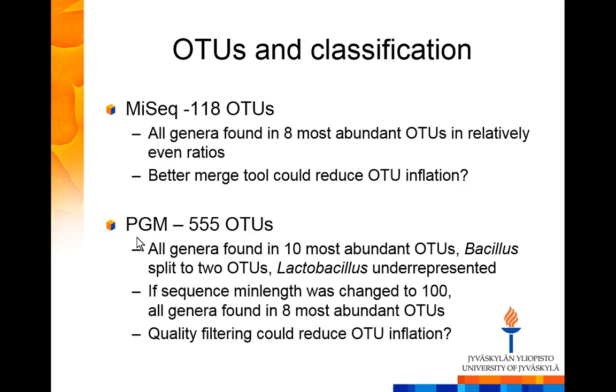For MiSeq, I think the main error is just a single nucleotide difference. For a single nucleotide, it's not able to say which base it really is.